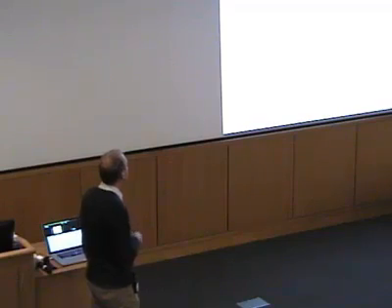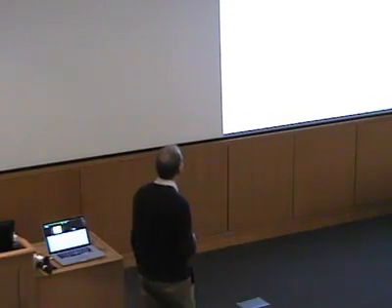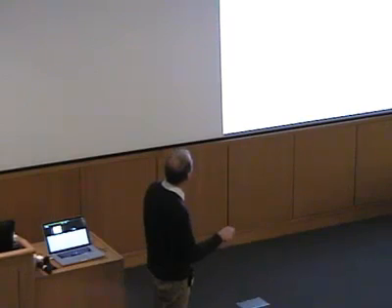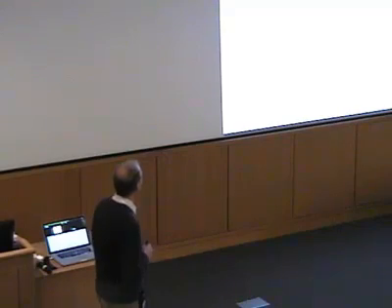If you compare that to the iron-sulfur clusters, which I just told you about, so this is what a photosystem 1 sample would look like if I don't have a single crystal, but just a solution which I've frozen, then you can see that I can resolve very nicely the 3 components for FA, and then if we look a little bit closer, the ones with the stars here are for the FB, which are a little bit buried, but you can pick them out relatively well as well. Right? And so the reason for that, of course, is that the spin-orbit coupling is stronger within an iron-sulfur cluster than it is within an organic species like the chlorophyll.